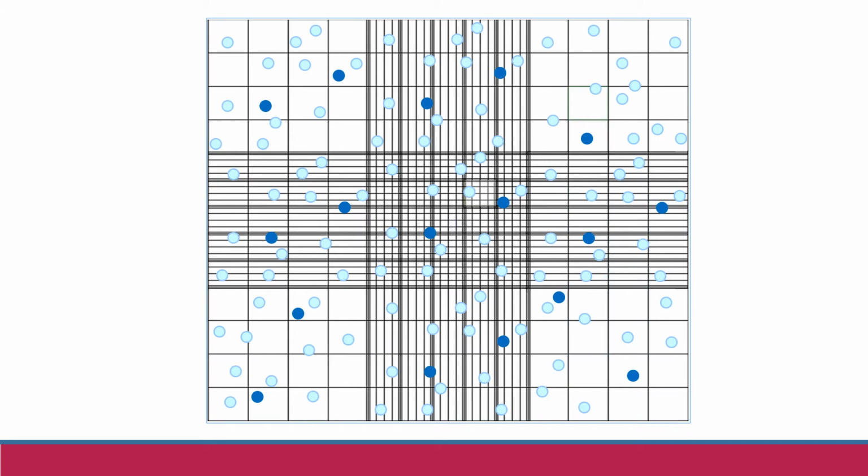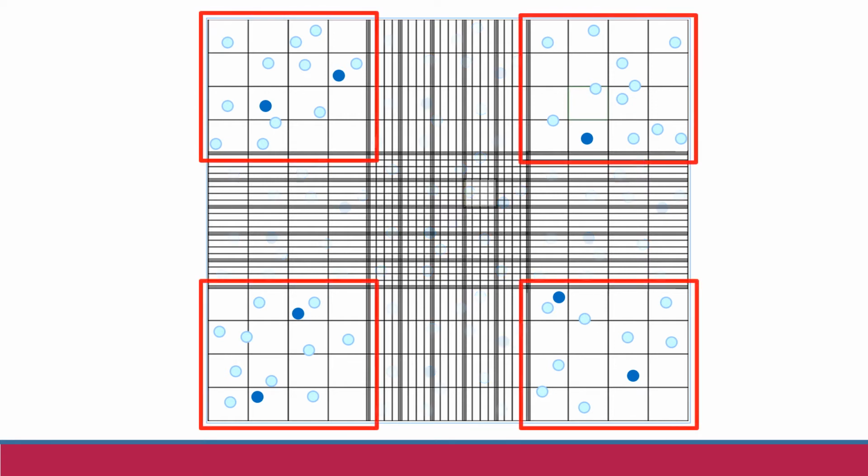When you look in the microscope, you will see a field that looks like this, a series of grids and cells. We will only count the cells in the 4 corner quadrants. These quadrants consist of a 4x4 grid or 16 smaller squares. Count the total number of live and dead cells in each of the 4 large quadrants.